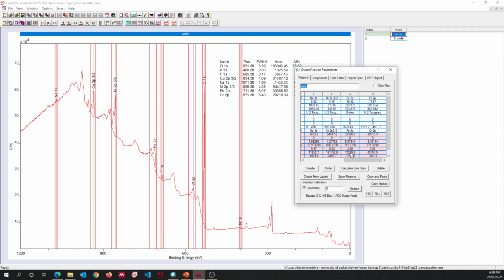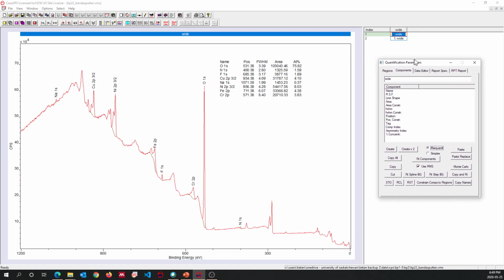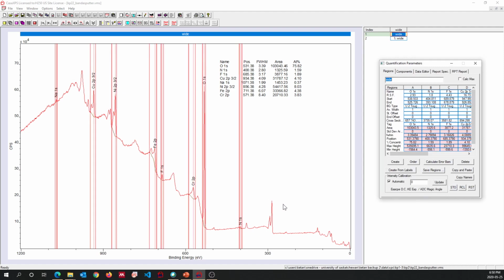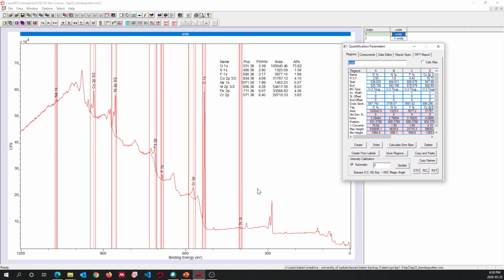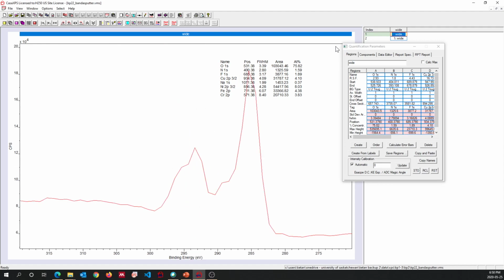You can rename it. Go here, go to white here. Did I delete it? Oh, sorry. I actually forgot to include carbon and potassium. I told you I would, I will be discussing it at the very end. Okay, let's do that. So let's zoom on to that. I almost forgot. Sorry about that.